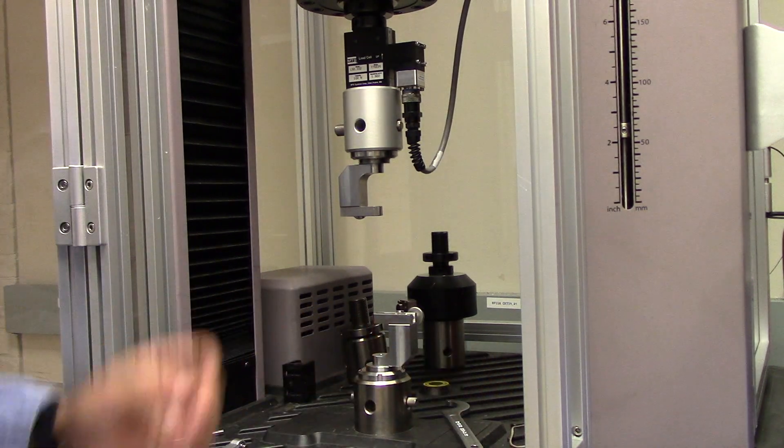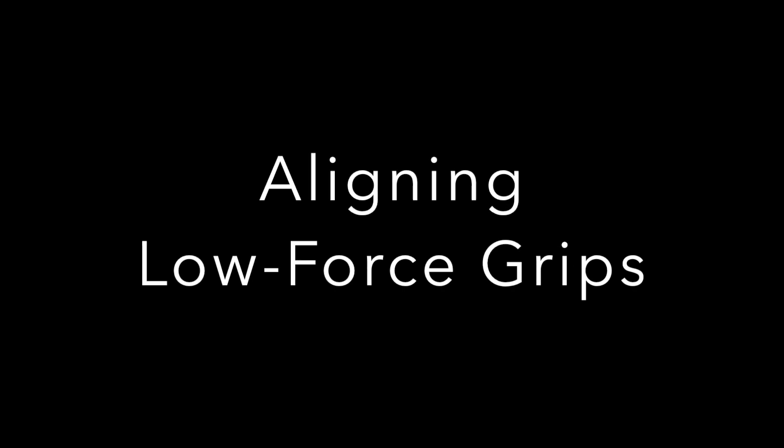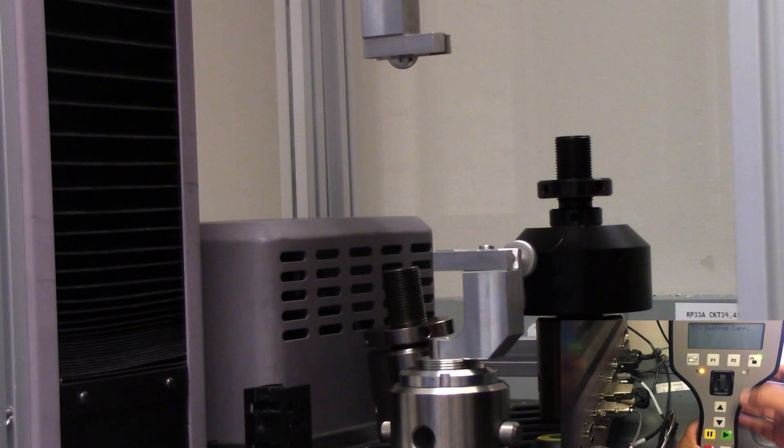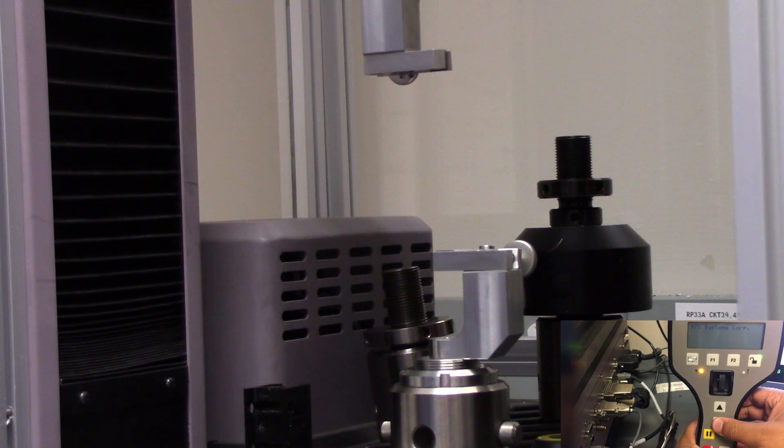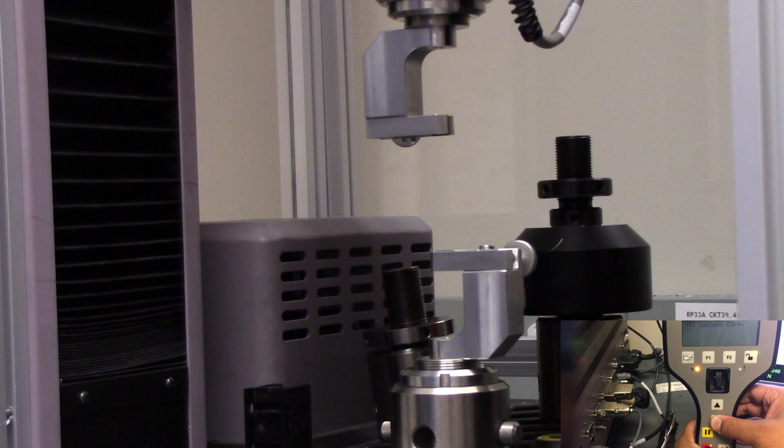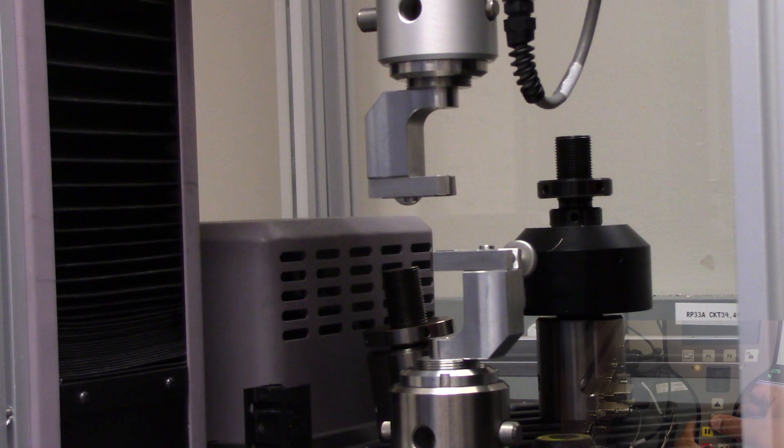Now let's move on to physically setting up our system for alignments. Conceptually, performing alignments is about the same as with high force testing. First, we're going to use the controller to bring the two grips close together. Remember that these arrows indicate coarse movement, while the wheel indicates fine movement. So, bring it nice and close. Now I'm going to lock the system.